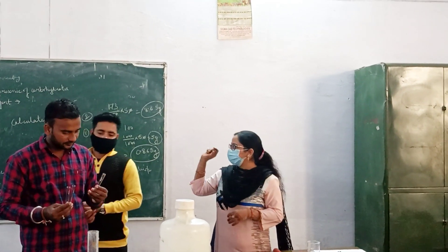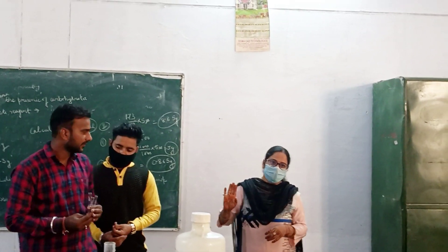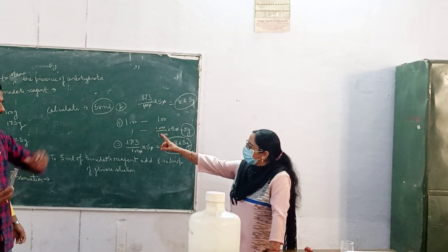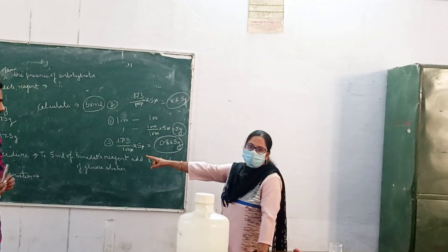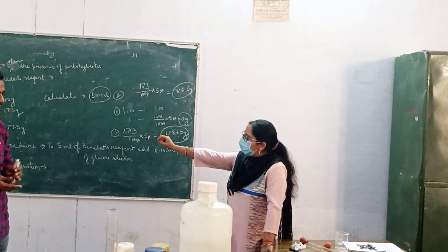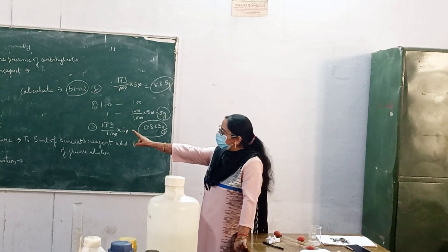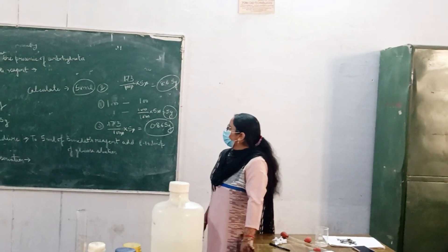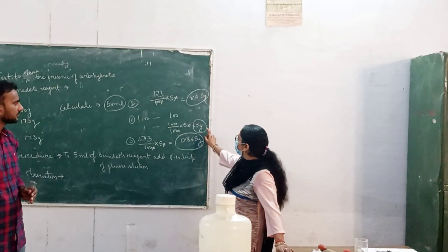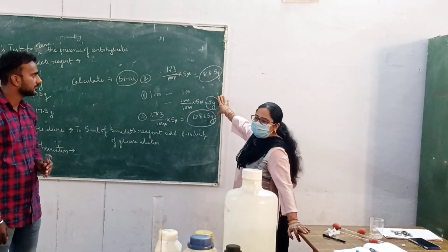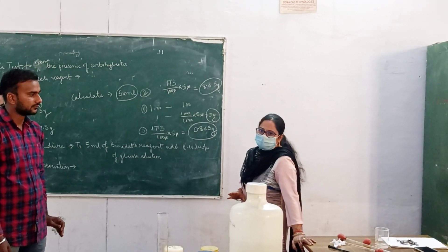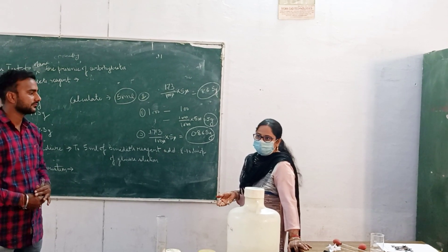So we are taking these three reagents: copper sulphate, sodium carbonate, and sodium citrate. We are weighing for 50 ml. The standard calculations for 1 liter are: sodium carbonate 100 grams, sodium citrate 173 grams, and copper sulphate 17.3 grams. But we have calculated for 50 ml, so these are the scaled-down calculations and we have to weigh accordingly.